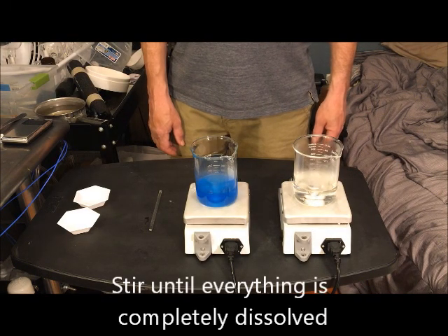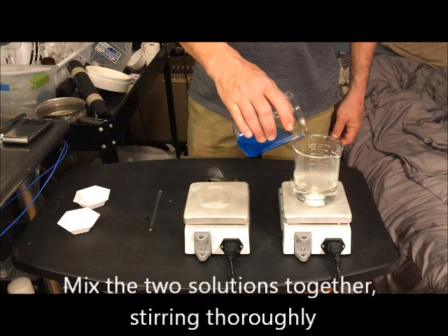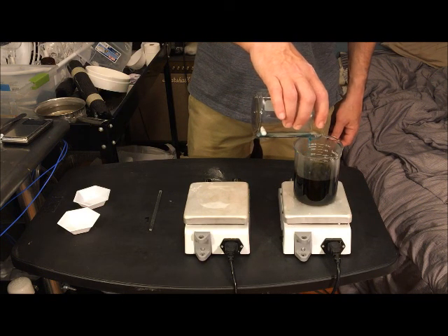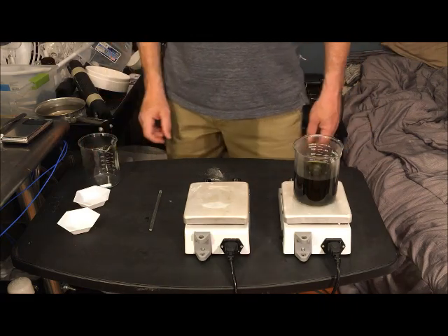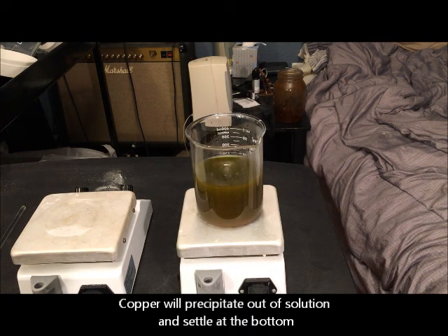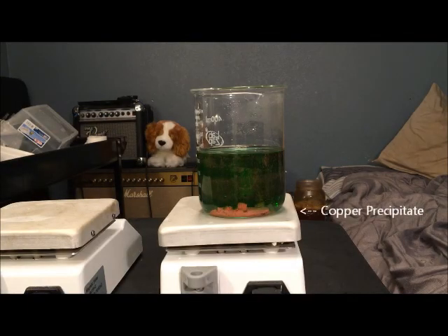Once all the solids are dissolved, combine the two solutions by pouring the copper sulfate solution into the ascorbic acid solution. This will cause the liquid to immediately turn a greenish-brown color. Continue stirring thoroughly. After a while you'll start to see the solid copper settle at the bottom of the container — a salmon-colored, powdery-looking substance — and the liquid will continue to get lighter. When the reaction is complete, all the copper will have formed a solid layer at the bottom and the liquid will have turned an emerald green, translucent color.